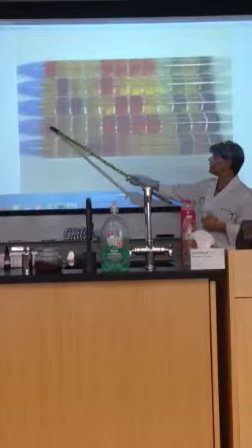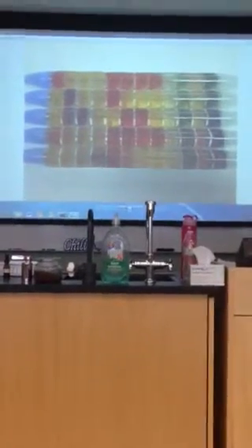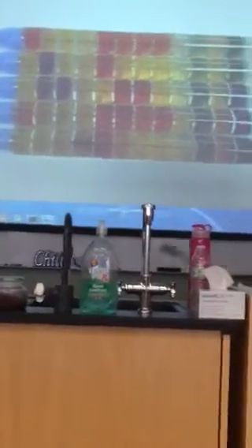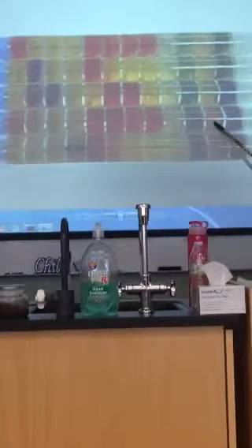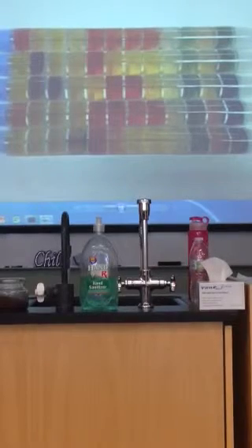If it were a facultative anaerobe, it would ferment the glucose. I mean, if it were Enterobacteriaceae, they're all glycolytic, this would be yellow. So I immediately know it's not Enterobacteriaceae. And these are all considered negatives, except the last one, which is the test for citrate.